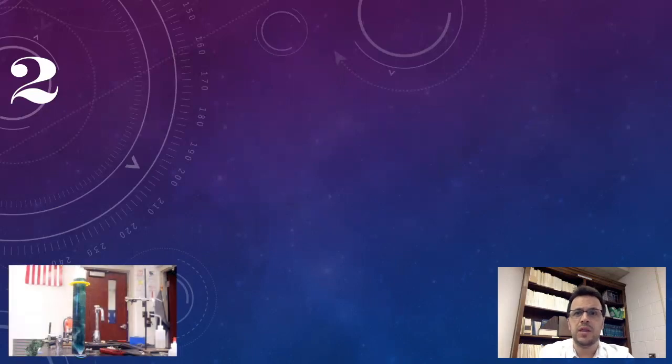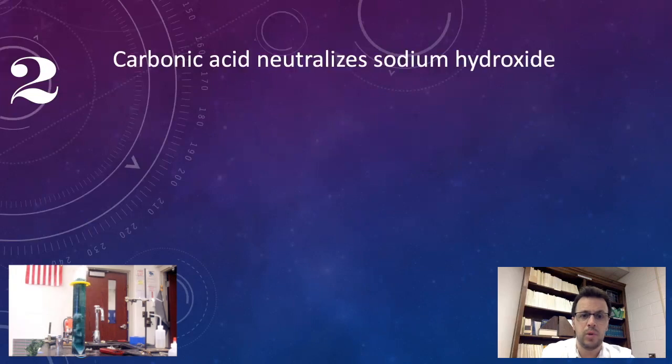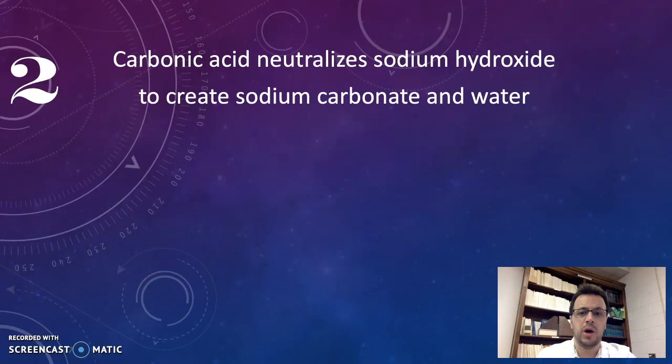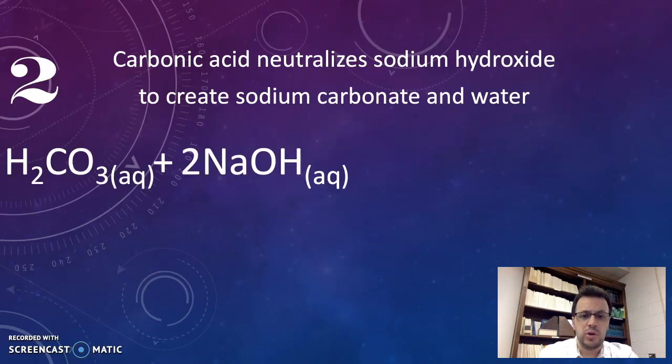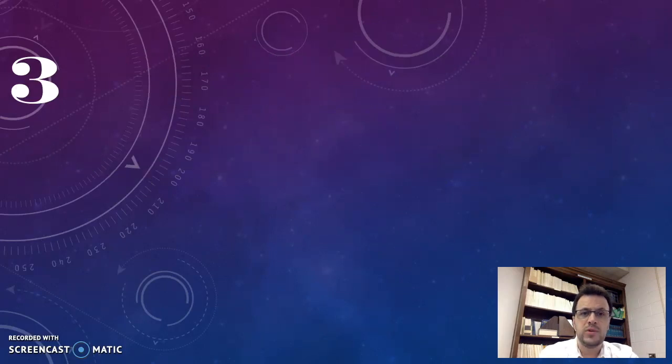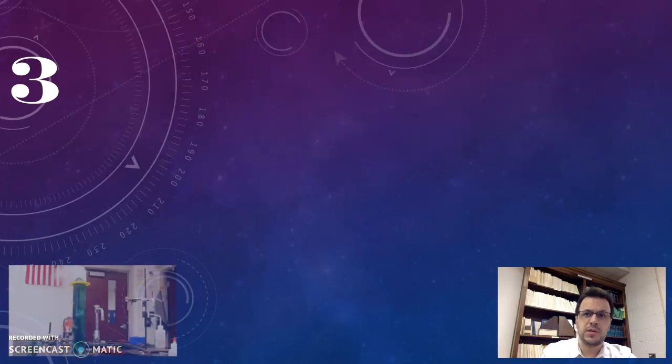this is the acid-base reaction between sodium hydroxide and carbonic acid. Carbonic acid neutralizes sodium hydroxide to create sodium carbonate and water. Once the sodium hydroxide is neutralized, the pH is pushed into the acidic range.